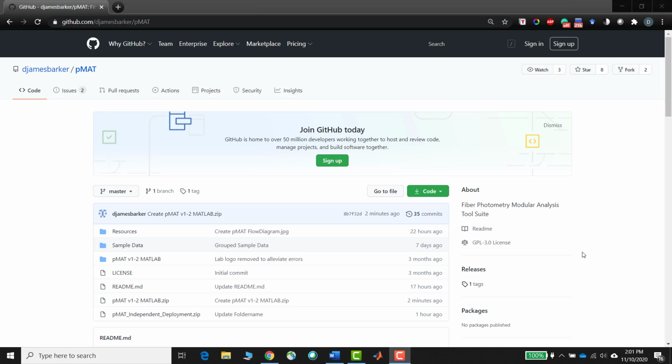Hey there again, I hope you're doing well and welcome back to another pMAT quick tutorial video. Today we're going to be talking about how to install pMAT for use in MATLAB.